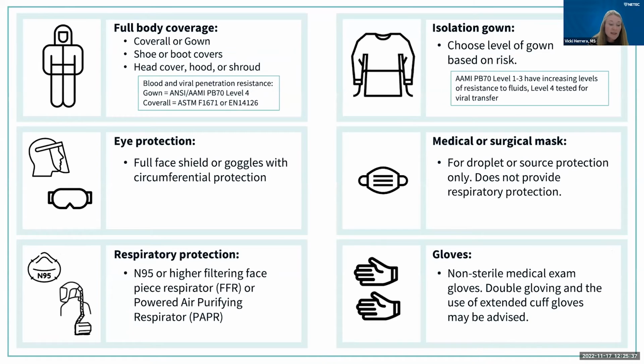Both CDC and NETEC have a lot of informational resources regarding PPE. It's important to look at what you have on hand and see what makes sense for the tasks that you are doing. This is a NETEC provided schematic of some of the different types of PPEs and what you can use. Next slide, please.